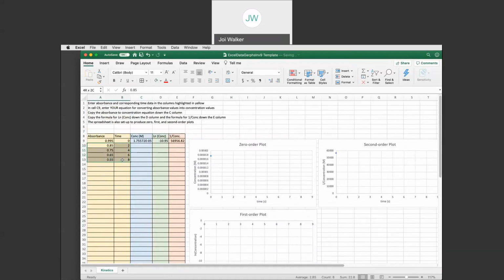All right, I just made it up. But here's the power of Excel. If I have my formula here, I don't have to enter it over and over. I just grab that little corner and I pull down, and look how the formula changed.